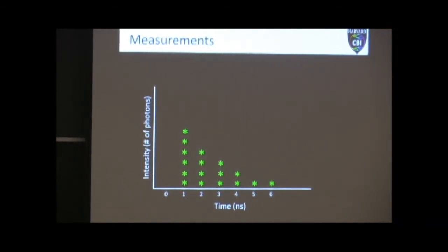Now, the truth of the matter is we are analyzing, I was going to say imaging, but it's not really imaging, the average lifetime of a fluorophore. Each one of these events that gets detected has a slightly different lifetime, and there are a number of reasons for that. Some of it is our ability to measure. Also, each electron spends a slightly different amount of time in that excited state.